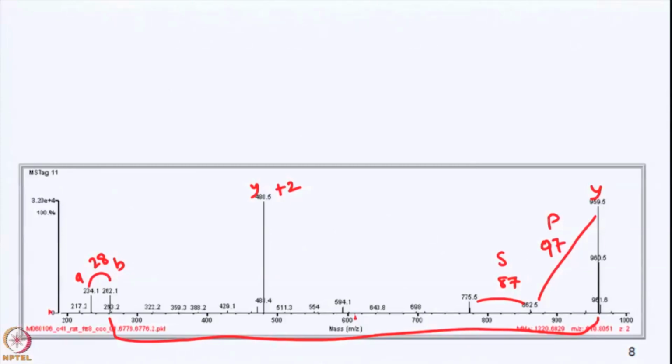So we don't have down to low mass. Okay, but so at some point there's some sequence here. That is PS, and then the distance here is something that adds up to 261. And then the distance out to here would be 775.